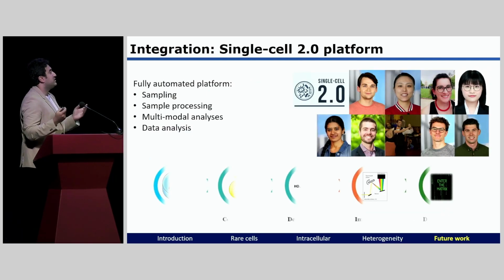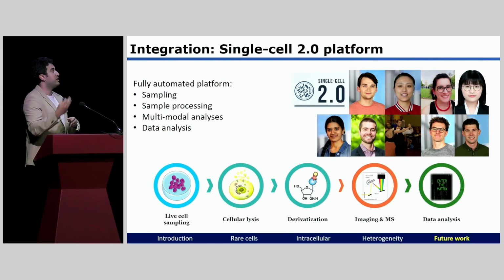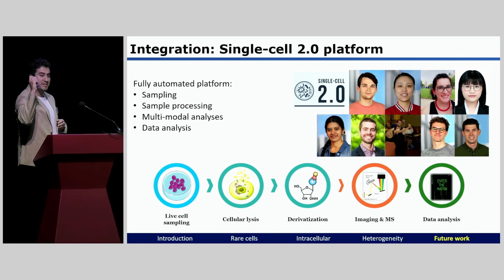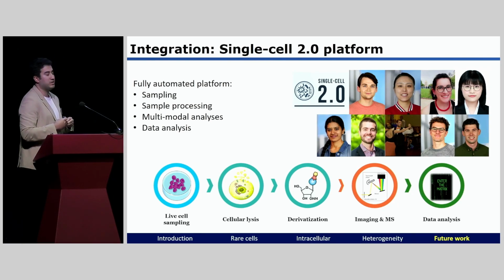Now, to integrate all the cool technology that you've seen here today, I'm also working with another equally wonderful group of people here. I think we have like 6 or 7 in total, so single cell, yay. That basically integrates everything that I talked about, and also adds to it the ability to do imaging at the same time, multimodal spectral analysis, and derivatization and cellular lysis in a controlled manner. Now this, we will not see this year, but hopefully in a year or 2, we'll have it also done.